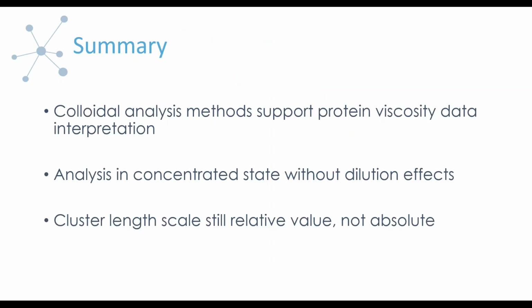So with all that, I'll just quickly summarize. We always emphasize that doing an analysis of your data rather than just looking at it is always very beneficial. And in the case of protein formulations, although it's not a perfect comparison, I feel that adopting certain ideas from colloidal systems is quite beneficial and helps you get a deeper perspective into what's happening. An advantage of analyzing rheology data on concentrated systems is we're not dealing with any dilution effects and breakup of reversible clusters that may happen through dilution. So we're getting a better picture of what's happening in the concentrated state.